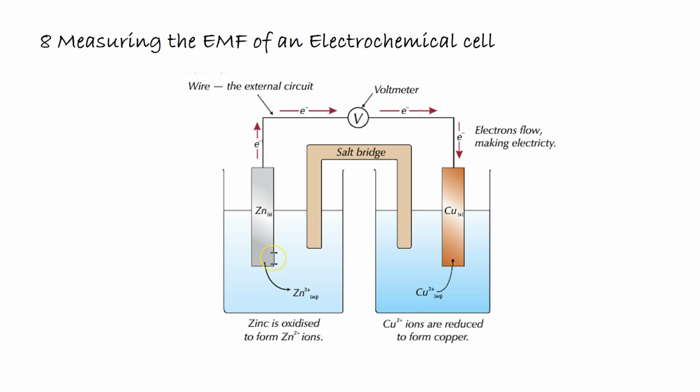In an electrochemical cell, you have to do a few key things in order to measure the voltage between two half cells. The first thing that is required is you need to ensure that you have drawn, if you're asked to, electrodes. And these electrodes require two things. They have to be able to conduct electricity, obviously, otherwise if they can't pass electrons, they're no use. And they need to be either part of the half cell.